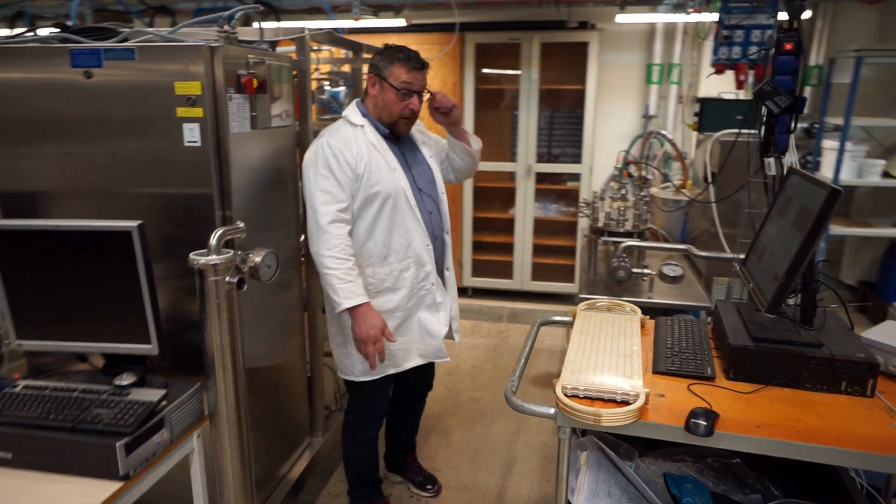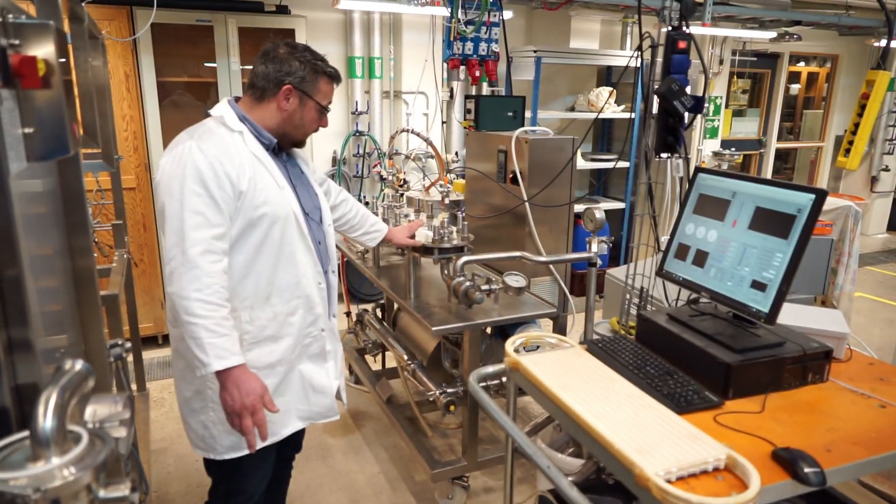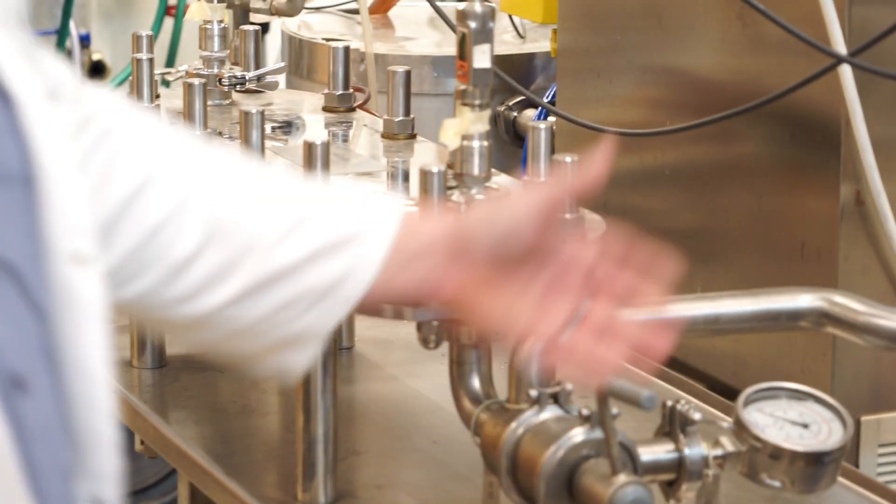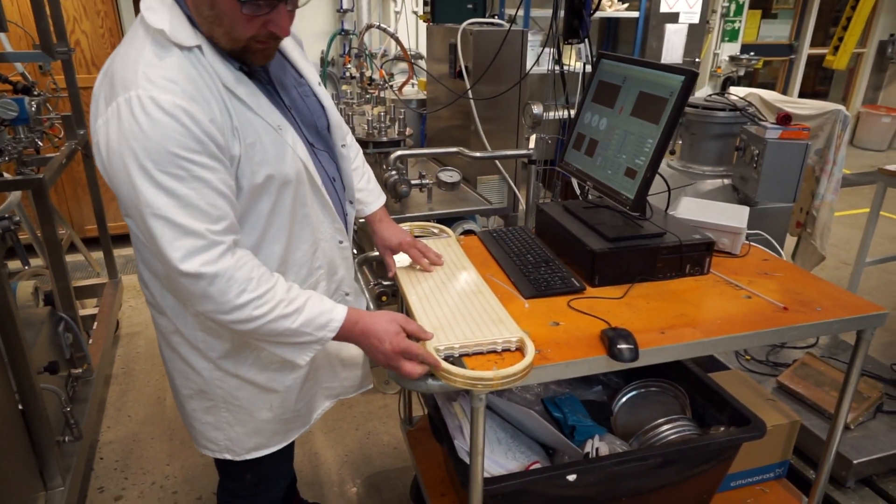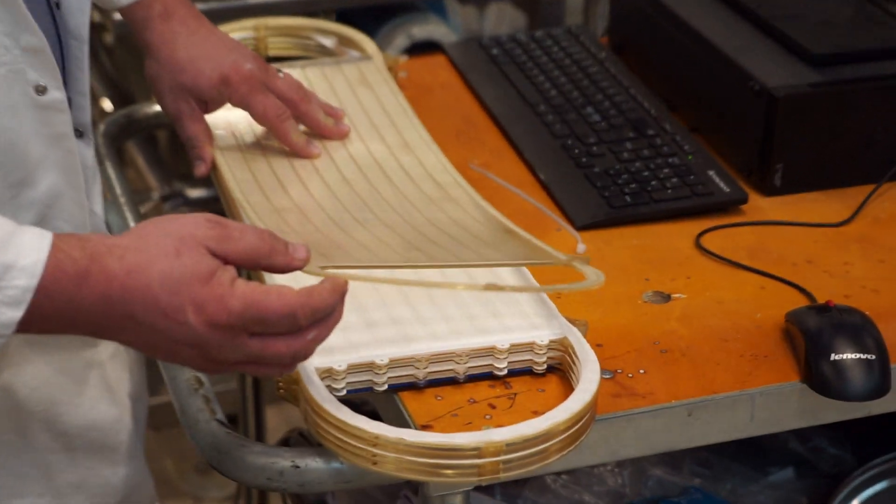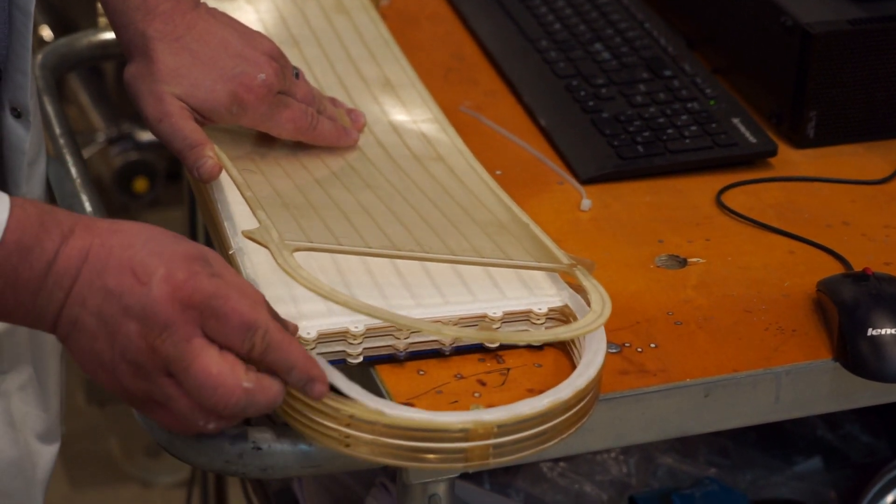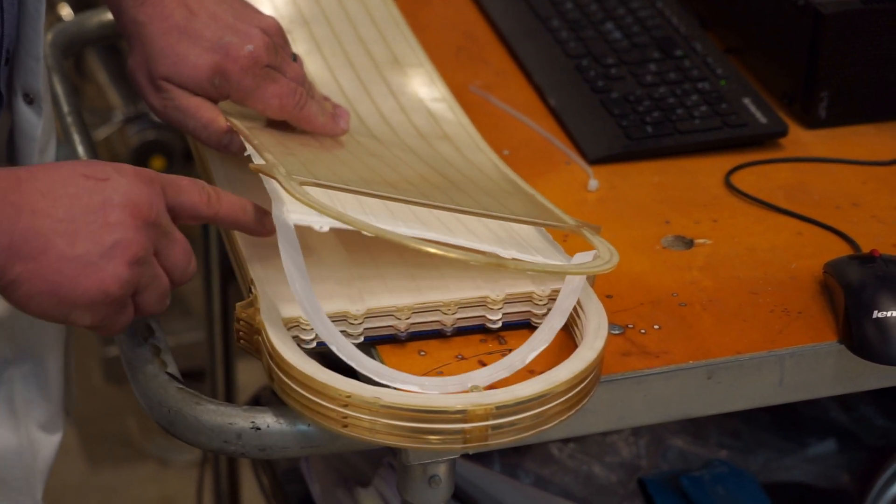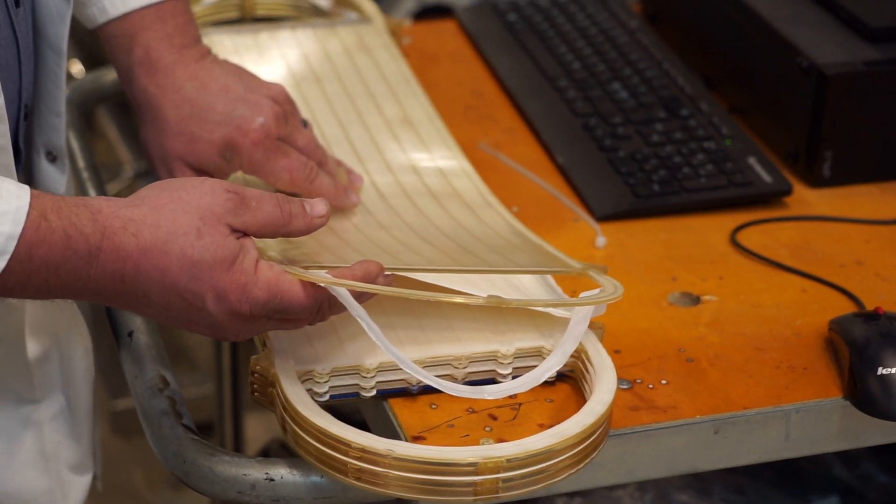So right now there's a plate and frame module, and the module is here. The membranes are sitting in here, and they look like this. There's a plate that the membrane rests on, there's a membrane, and there's a second membrane. So between these two membranes, the liquid flows.